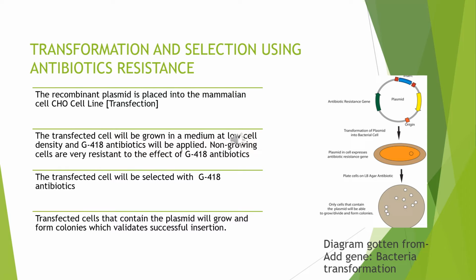The transfected cells will be placed in a medium and antibiotics will be added. Non-transfected cells are not resistant to the effect of G418 antibiotic. The transfected cells that carry the plasmid will grow and form colonies, which validates successful insertion.